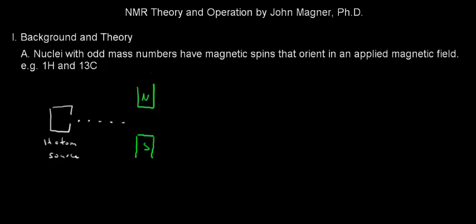What we find is, very strangely, half of the hydrogen atoms are deflected towards the north pole of the magnet and half are deflected towards the south pole of the magnet. And we learned that this was the basis for one of our principal quantum numbers for electrons, because electrons have the same property. And that is that certain atoms, certain atomic nuclei, including hydrogen, have magnetic moments that will align in a magnetic field, also known as magnetic spins.